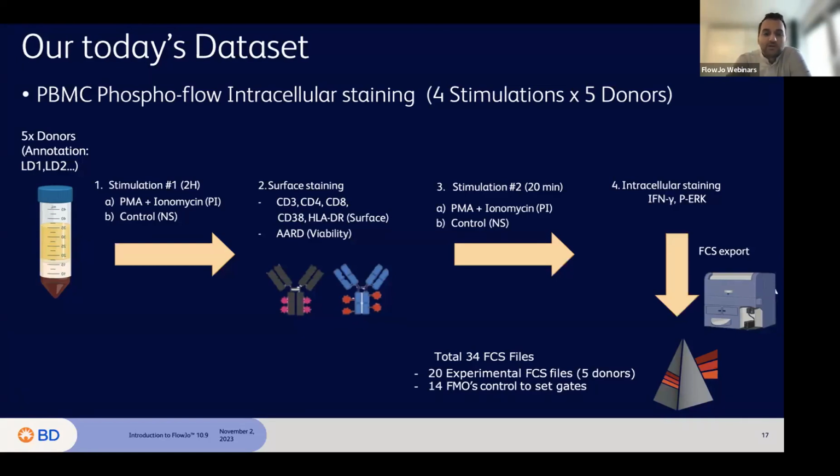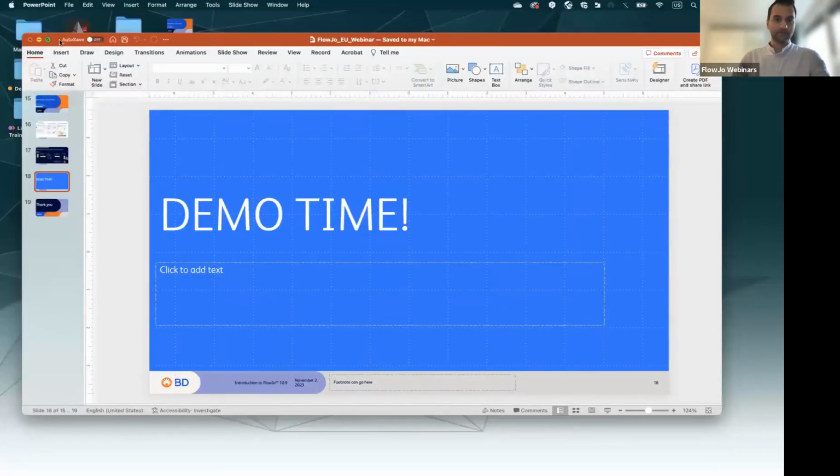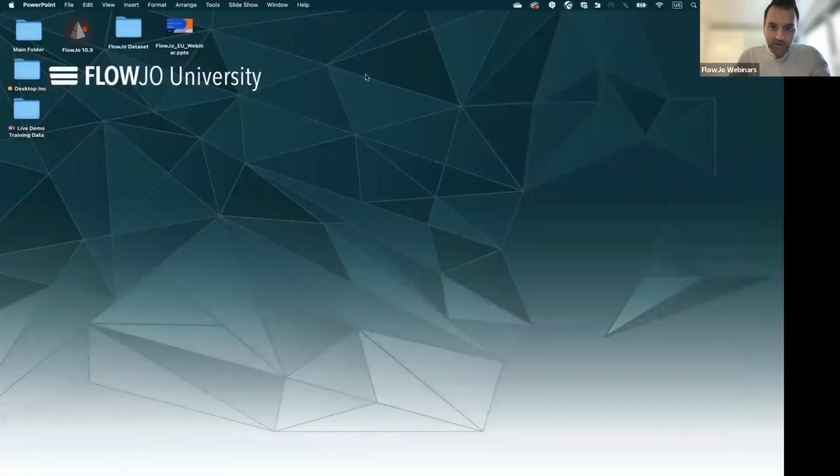Okay, so that's it with the slides. I don't have many slides. I prefer that we see everything else in the software. So let's get started. Okay, so just check the Q&A box.